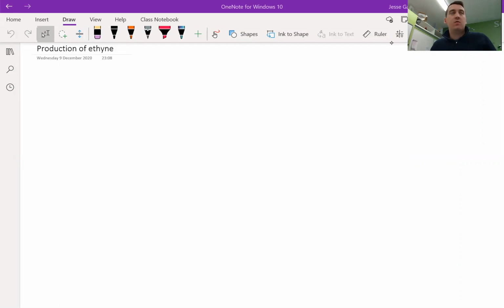This is video 2 in our organic chemistry experiment series. If you haven't watched video number 1, I suggest you go back and watch it, where we were discussing the production of ethene gas and the testing of its properties. In this video, we'll be looking at the production of Ethyne gas, and the testing of its properties.